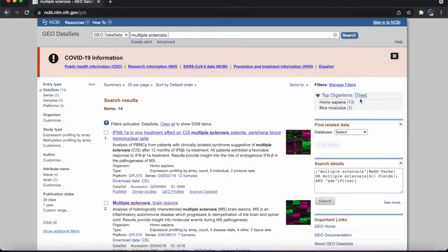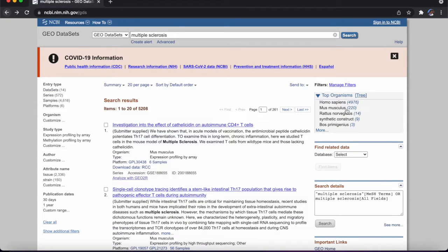side. So normally, right, before we click datasets, there were a bunch of different organisms right here, all written in their Latin scientific names, right? And it can get a little bit confusing. But actually, GEO has this incredible tool where if you just hover over the organism, it'll give you the non-scientific name for it. So for example, Rattus norvegicus, I probably butchered that, but if you hover over it, it just tells you, oh, it's rodents.